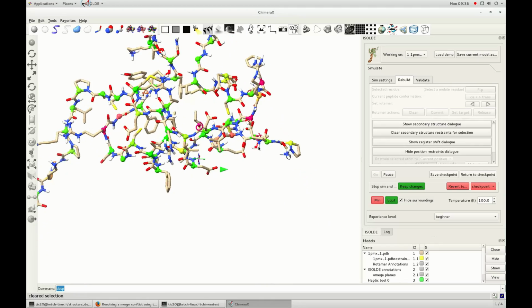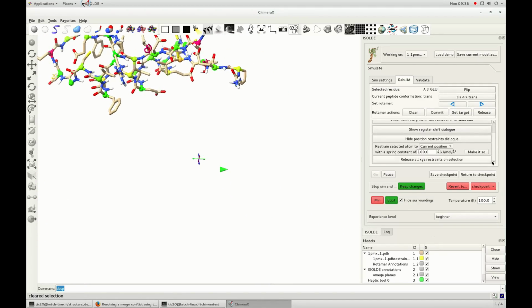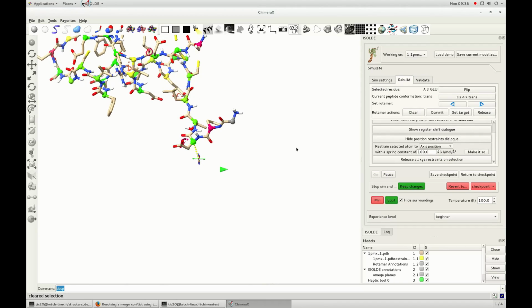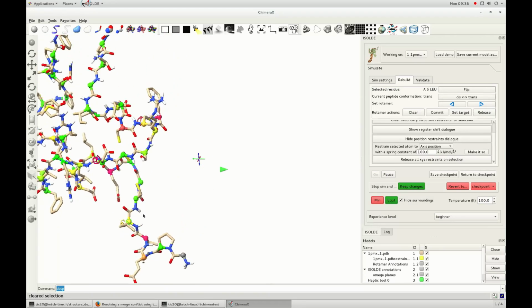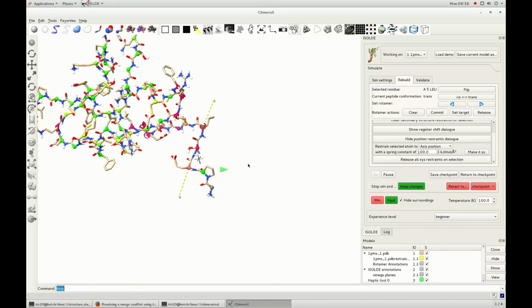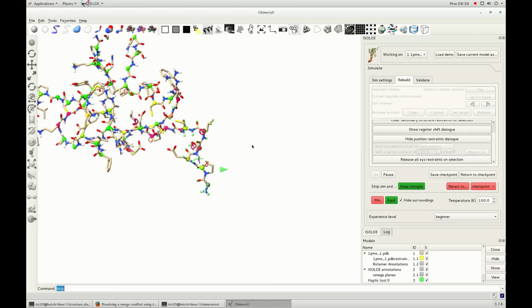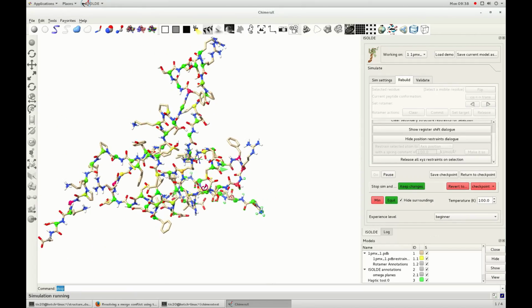While individual atoms can be tugged directly using the keyboard and mouse, this can be difficult to do accurately due to the unavoidable fact that a mouse can only tug in the two dimensions perpendicular to the direction of view. For large rearrangements, therefore, it's often easier to make extensive use of temporary position restraints, which can be accessed at the bottom of the Rebuild tab. These are also useful in various other situations, for example for keeping side chains away from unfilled ligand density.